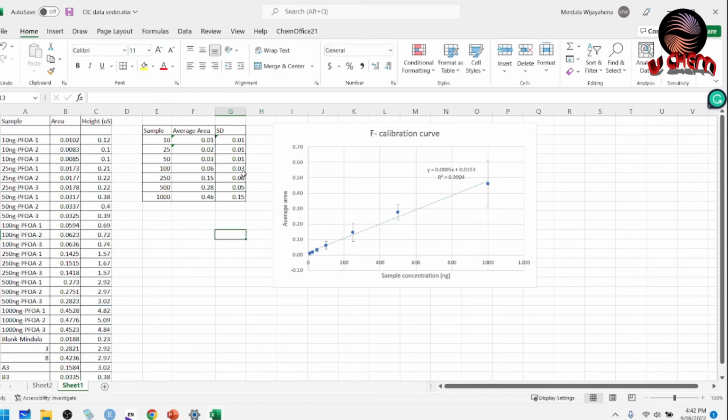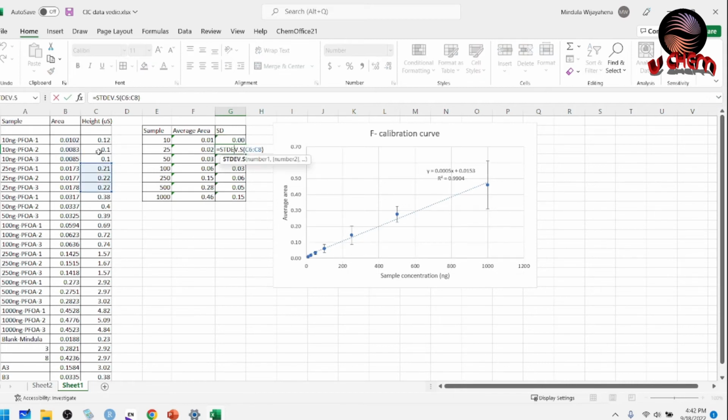So with those results, oh, I selected the wrong one. See, I told you need to select the correct ones. Obviously these shouldn't be 0. I will fix it, otherwise we're gonna do a wrong thing here.